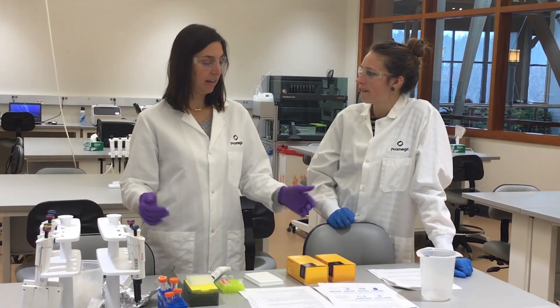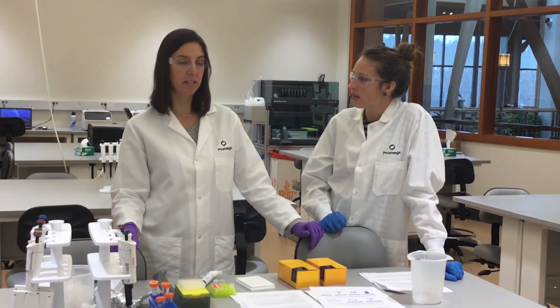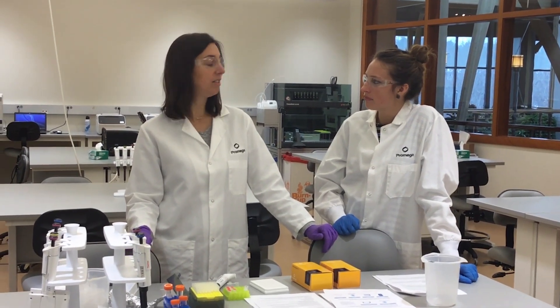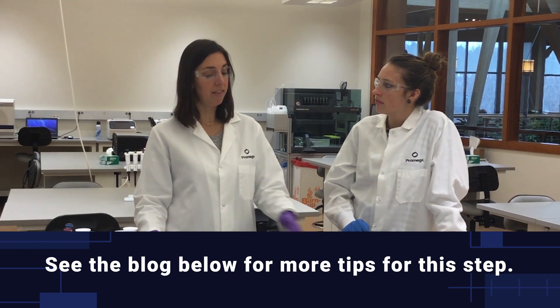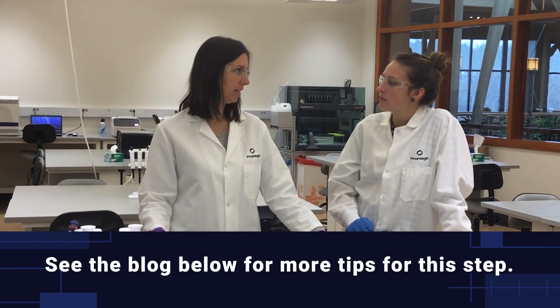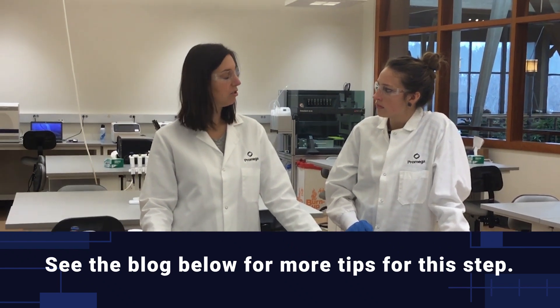Once it's complete and everything's ready, the next thing to do is to add it to the cells. There are a number of ways you can do this. If you have access to a nucleofector instrument, that would be ideal — in that case you would just follow their cell line specific protocol for the cell line that you're working with. It's really easy and straightforward to do.